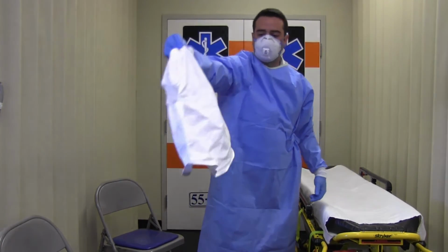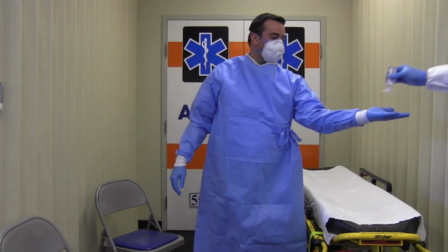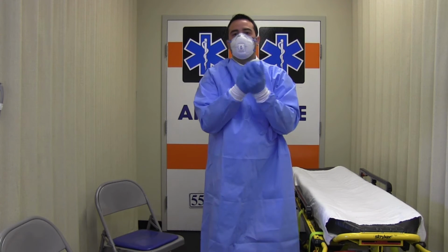Next, you'll remove your surgical hood. Gently remove and discard. You will then disinfect your inner gloves with an alcohol-based hand rub.